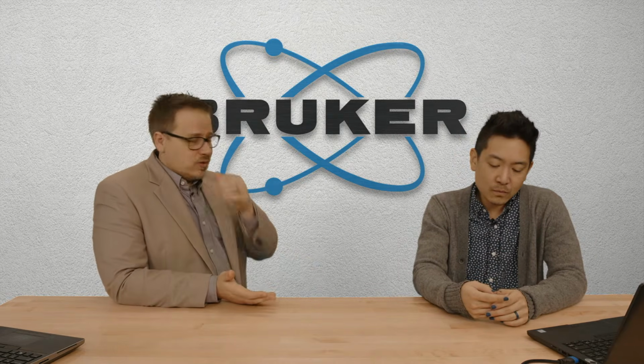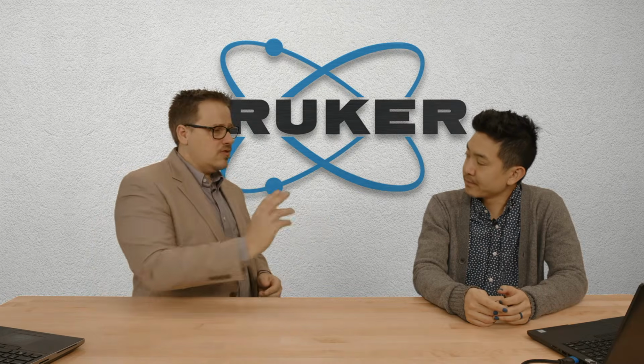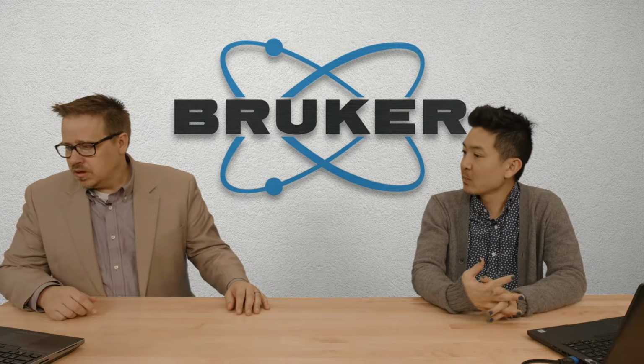One other thing I would note is if you don't have a 2D detector, we also have this new method called Bragg 2D. You can look it up on the web, Bragg and then 2D. It's a way you can use a Bragg-Brentano geometry with a line detector to generate some of these 2D graphs, and EVA supports that directly. So a great way to know if your sample's prepped correctly.